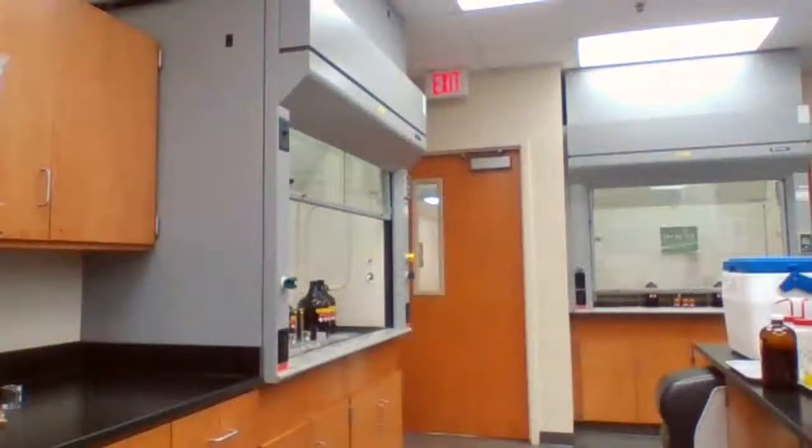I have to wait for the solid ammonium chloride. So let me get the solid ammonium chloride. Can I please get solid ammonium chloride?